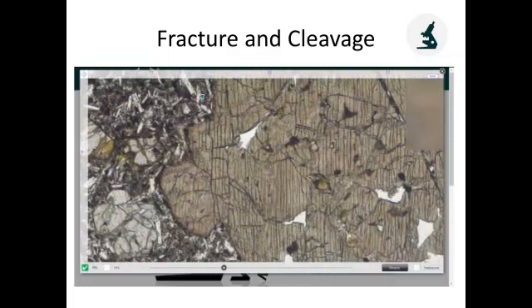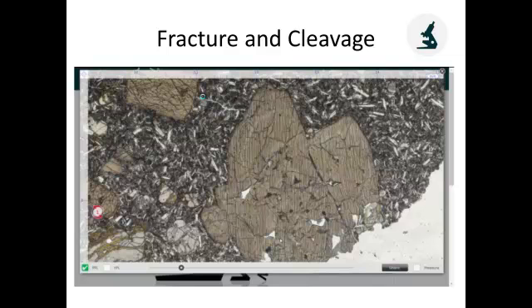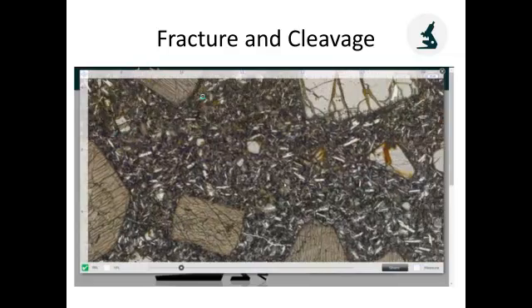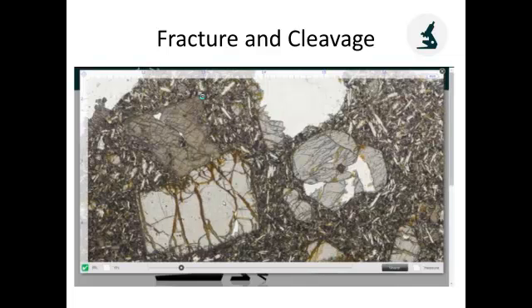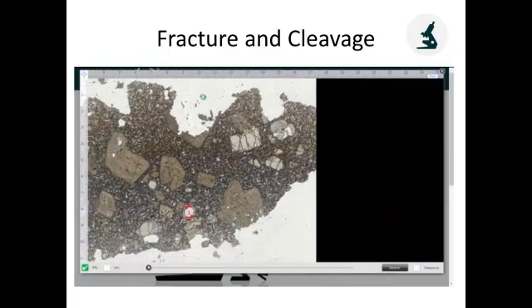Here's another one, even more fractures here, sort of randomly oriented, filled with chlorite. Very different. Okay, it's a slightly different color, but look at that cleavage. Strongly aligned in this pyroxene. Further up the thin section, there's some more pyroxene phenocrysts. Again, strongly aligned cleavage. And that oblong one there in the middle looks like it just about has two. There's some fracture in there as well.